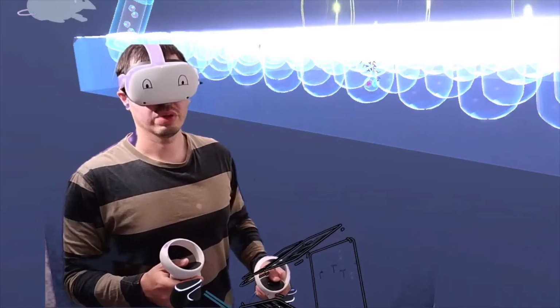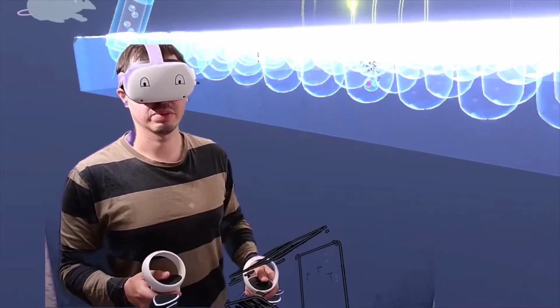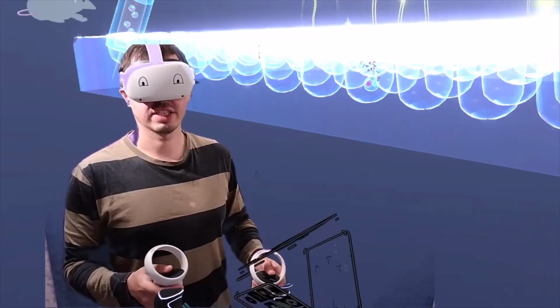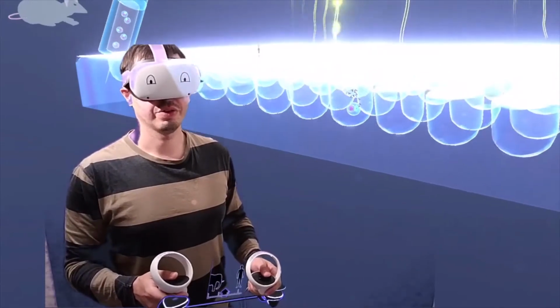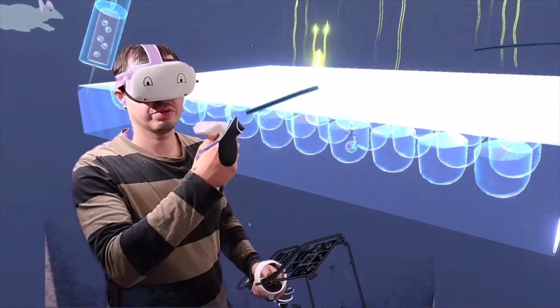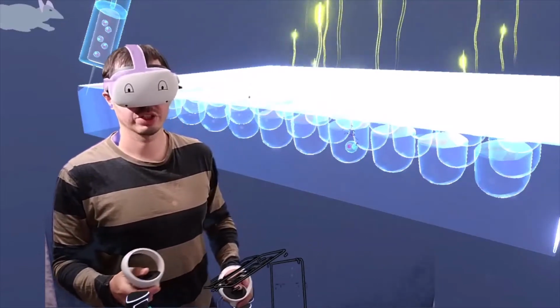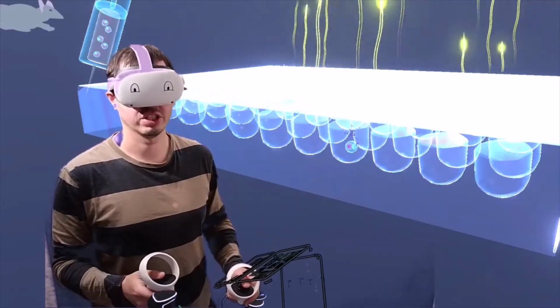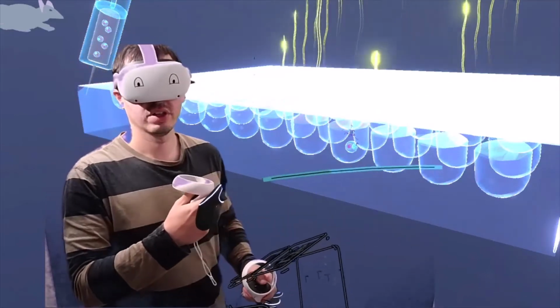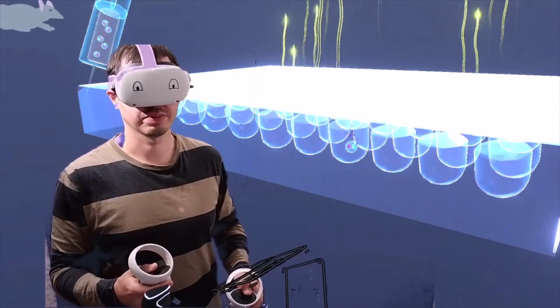Also, what you have in the well plate is a system that reveals the presence of interesting antibodies. These antibodies are basically the ones that react against the antigen. So if you put in a system, for example, that gives you a fluorescent signal when you have an interaction between the antibody and the antigen, you can tell in which wells you have the antibody that is capable of binding to the antigen.